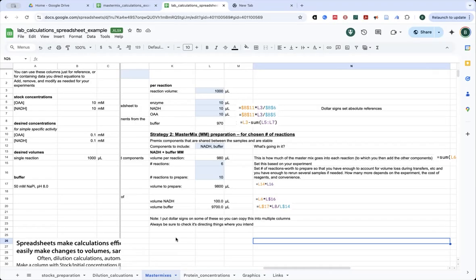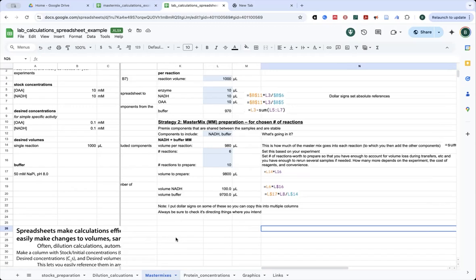But anyway, going back to the spreadsheets, one thing to be a little aware of is to be careful when you're copying and pasting. So always be checking, make sure that the values before you copy them are the same as the values after you copy them. And so when you just want to paste the values, what you want to do is do Command-Shift-V.